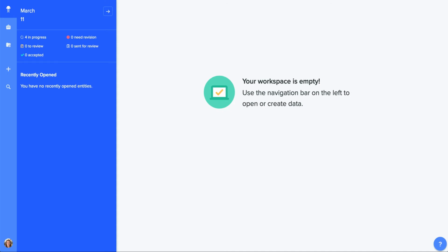In this side panel, you can easily access important files. The notifications at the very top tell you about the review status of your Benchling notebook entries. We'll cover Witness and Review, the related feature, in a later video. Below that, you can access all of your recently opened files.